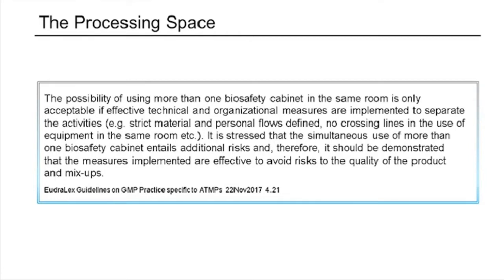Here we see possibility of using more than one biosafety cabinet in the same room is only acceptable if effective technical and organizational measures are implemented to separate the activities, e.g. strict material and personnel flows defined, no crossing lines in the use of equipment in the same room.